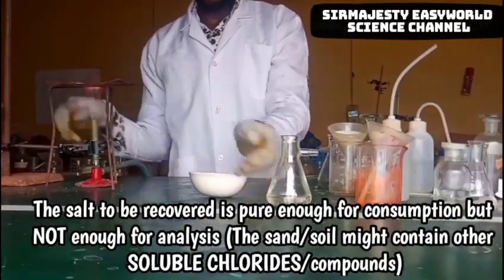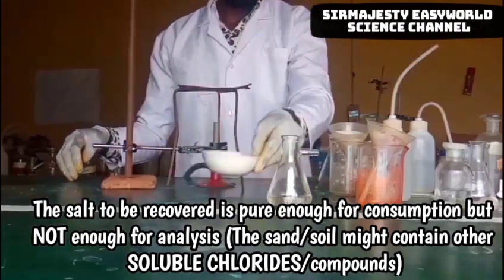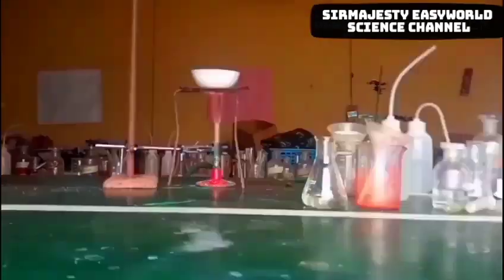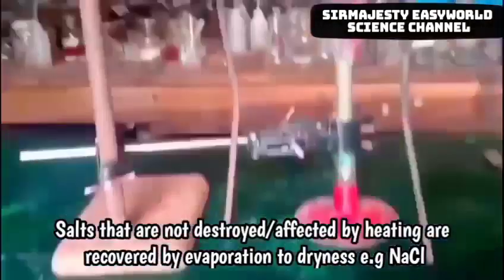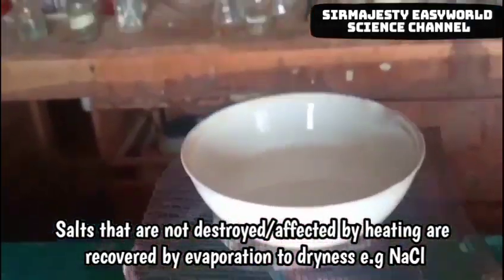On evaporation to dryness, you will recover very pure sodium chloride — not chemically pure enough for analysis, but pure enough for human consumption. We recover this sodium chloride from solution by evaporation to dryness. There is another method called crystallization, but we use evaporation to dryness for sodium chloride because it is not decomposed or destroyed by strong heating. If it were a salt with water of crystallization, like copper(II) sulfate pentahydrate, you would need to use crystallization instead.